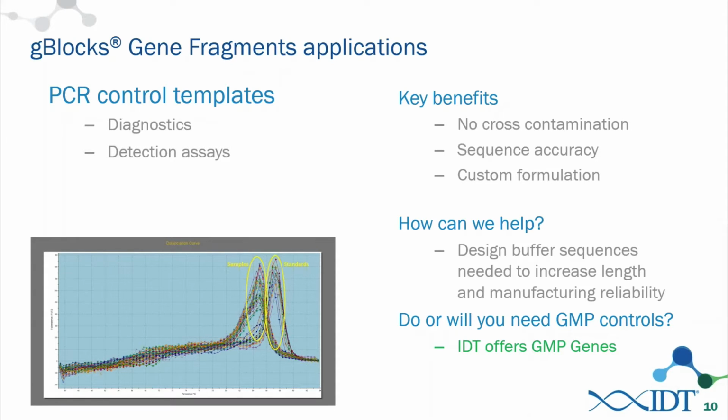And the reason for that is using a gBlock, you can put multiple templates, multiple targets on a single gBlock. By doing so, you ensure that you always have an equimolar ratio of the different targets when you spike that into an assay or when you use that to build a standard curve. So it's a really nice control to have in the experiment there.